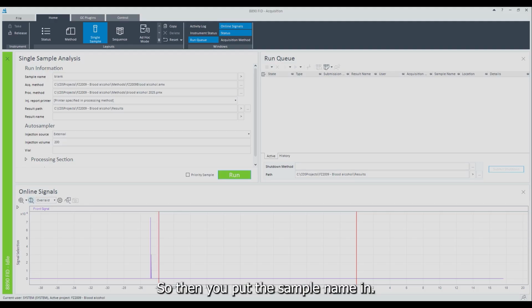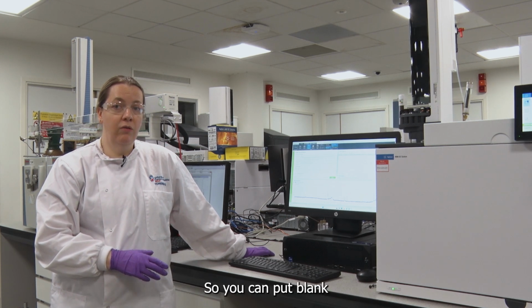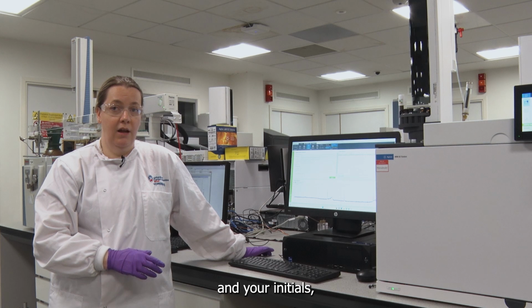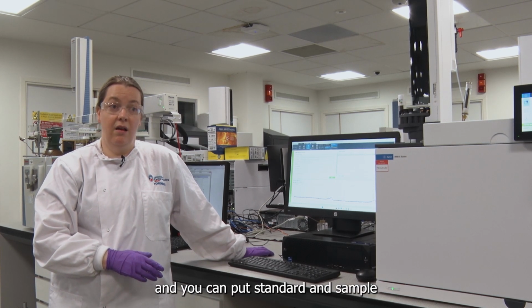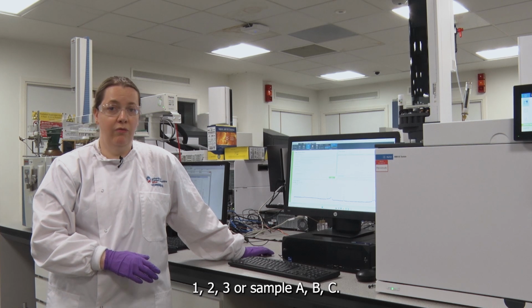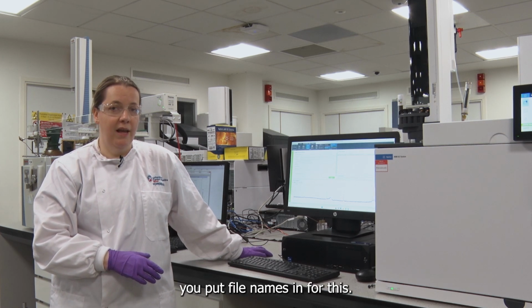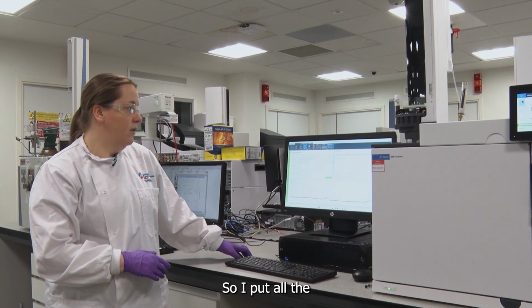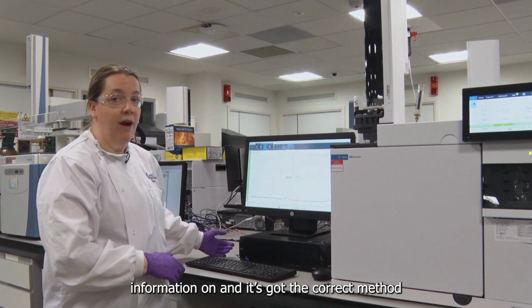So then you put the sample name in. So I'm running the first sample, which is the blank. So I've put blank in. When you put the sample name in, put something that's useful for you. So you can put your blank and your initials, and you can put standard and sample, and you can have sample 1, 2, 3 or sample ABC. You can have spaces when you put file names in for this. So I've put all the information on and it's got correct method.